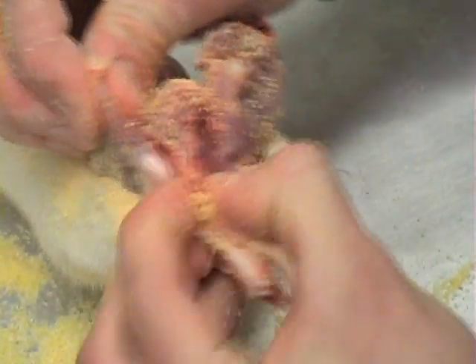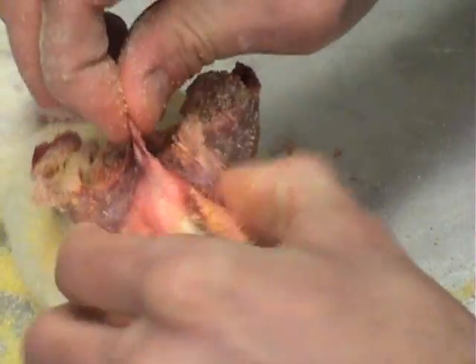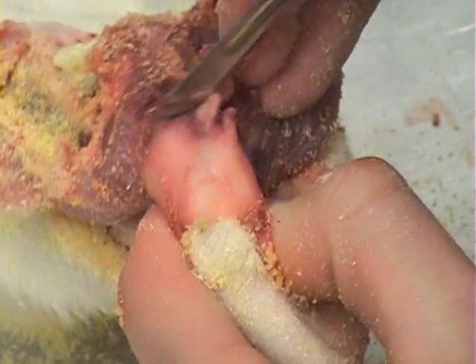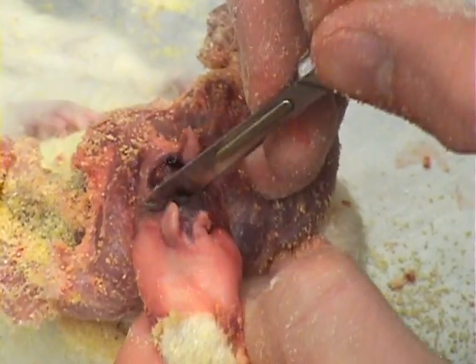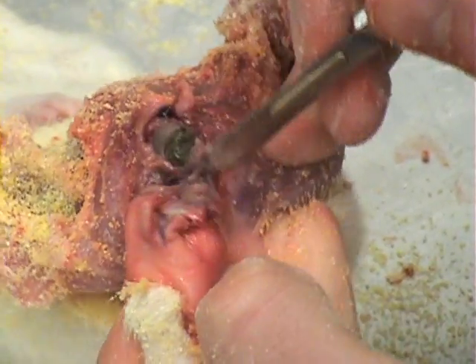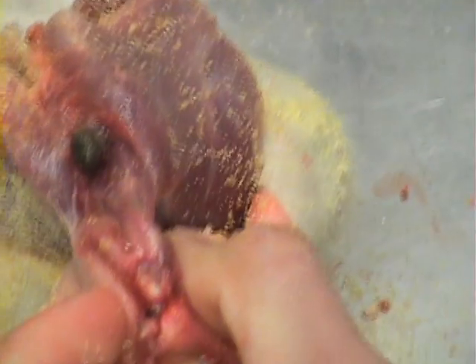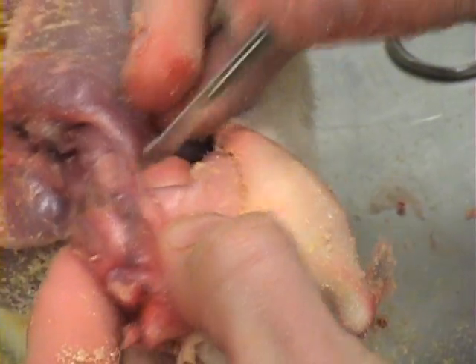Gently work the skin down both legs until the tail is the only remaining attachment. At this point you'll need to cut through the anus to detach the skin. Use a sharp scalpel to do this and gently cut down into the base of the tail. Gently cut away all remaining tissue around the tail until just the tail remains.